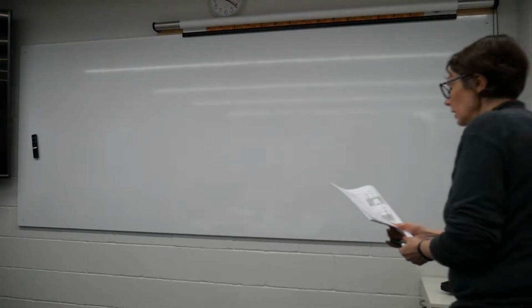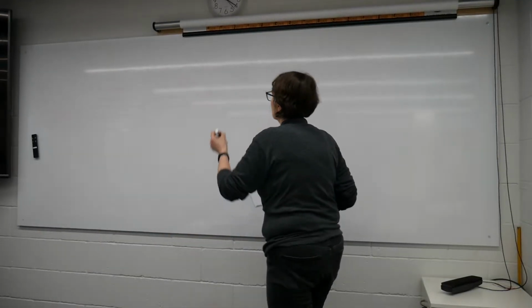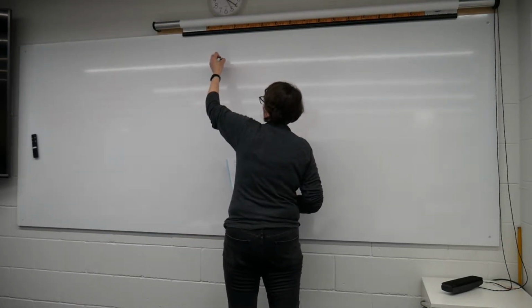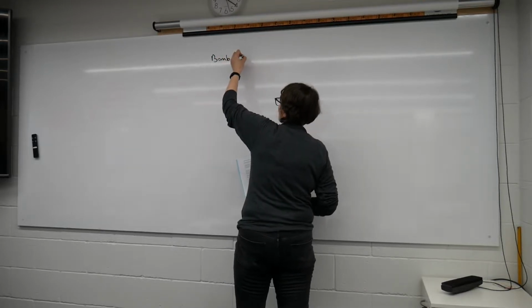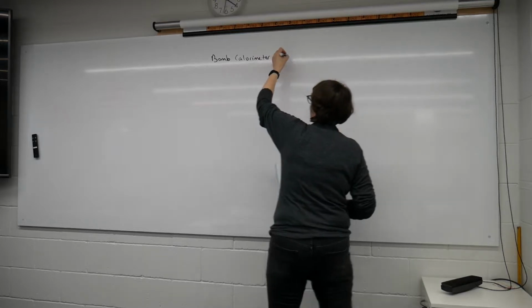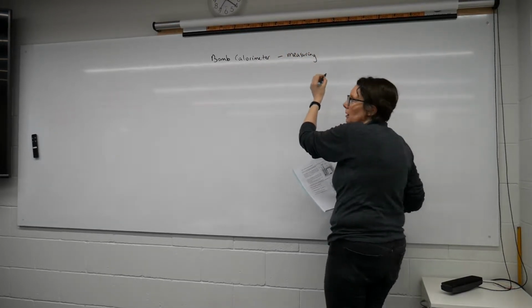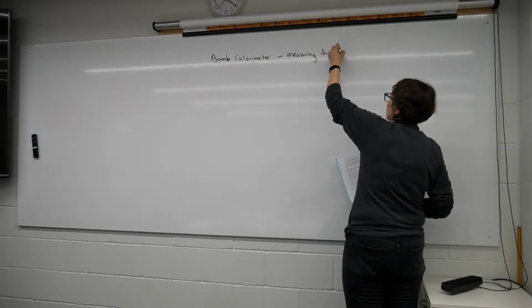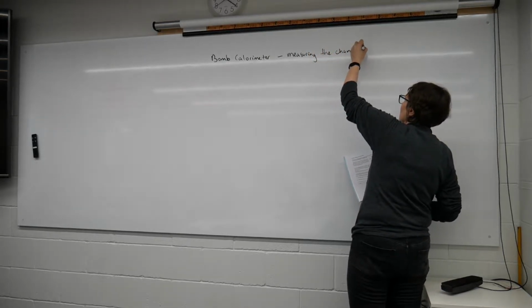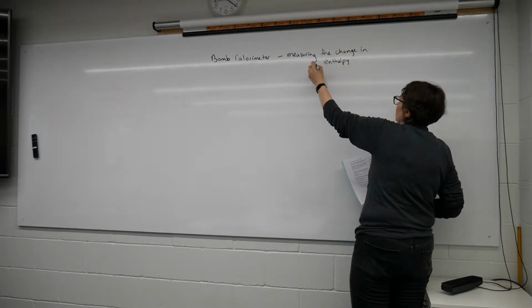So we're going to be looking at the bomb calorimeter. This is a way of measuring the change in enthalpy for a chemical reaction.